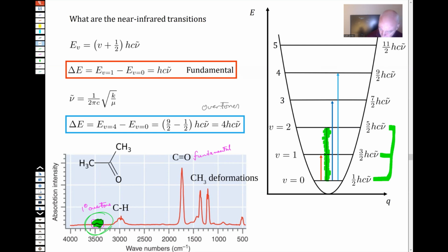And they give this near infrared spectrum, and you can see it's near infrared because here we were at 1700, and this is at about 3400. Next one's up, so we're going to be roughly 4200, I think, 5100, sorry, and so on and so forth. But actually what you normally see are CHs. So CH is 3000 here, then there'd be 6000, then 9000, then 12,000.